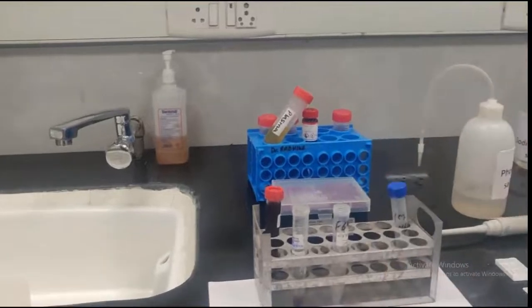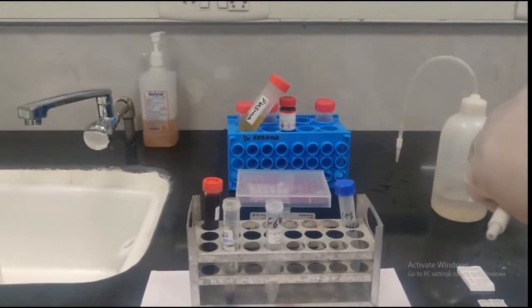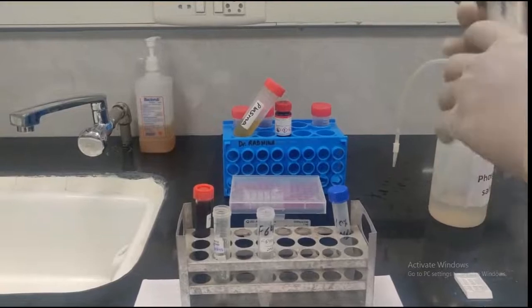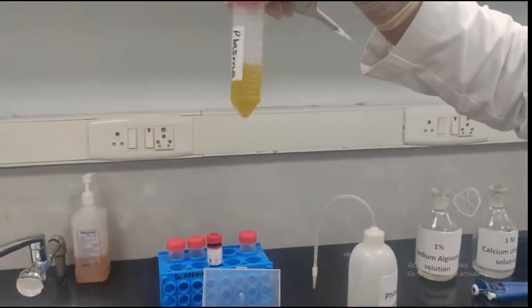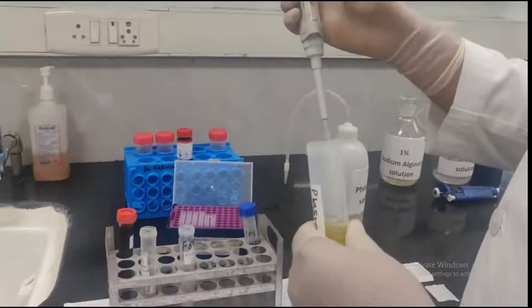And now we have to add plasma to these pellets. This plasma is the pooled plasma that has been obtained from the blood bank. So this is the pooled plasma sample. Now we will add 100 microliter of plasma to each of these pellets.